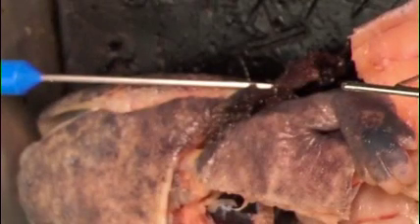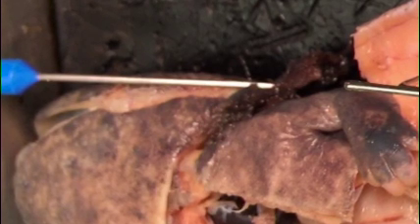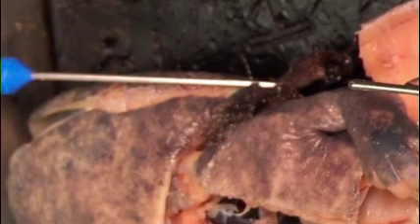These are the gills. The 3 external gills are conspicuous, and between them, the 2 gill slits open into the pharynx. However, the gills in Necturus are not homologous with those within the gill cavity in fishes. Respiration takes place on the surface of these gills and over the entire body surface.